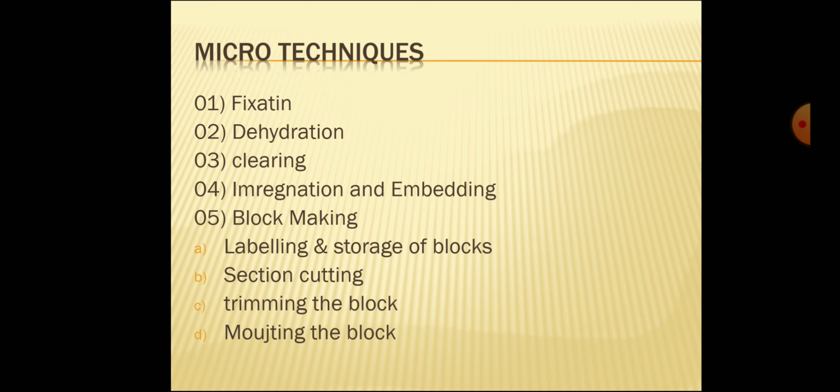During dehydration, some precautions are needed. Dehydration should be done in tightly closed specimen tubes. Specimen tubes should be completely drained before putting in a higher grade of alcohol. The specimen tube containing the material should be closed tightly with a glass cork.